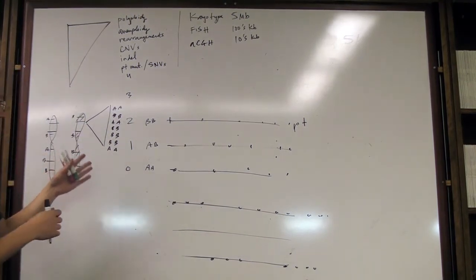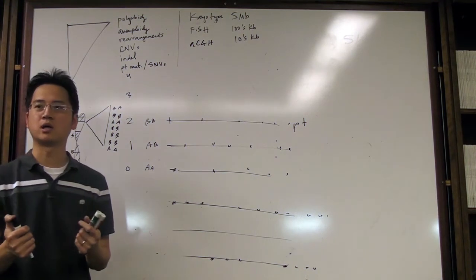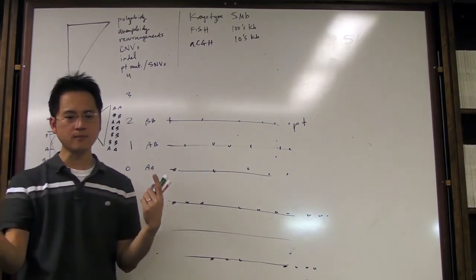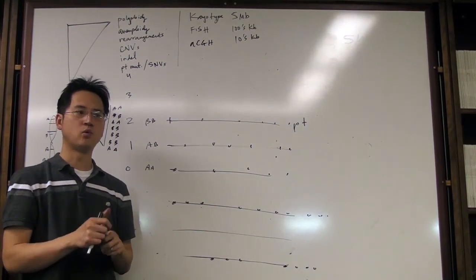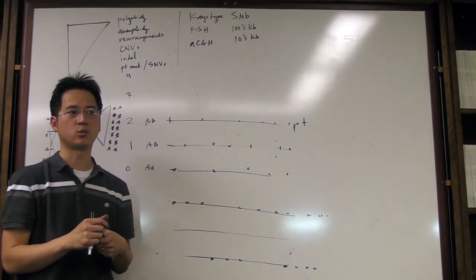And when is this significant? It depends. There's really no hard-cut standard rules for this. But typically if you are at the telomeric end, people say if it's 15 million bases or 20, that's when it's abnormal. And if it's more internal, maybe 10 million bases or so is when that's abnormal.